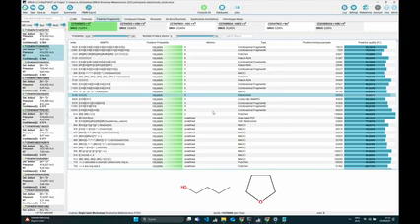In principle, it should work. I was wondering specifically because sometimes you might get compounds that are ionizable in both modes, and sometimes you don't, and then maybe it skews the ranking. You mean you include some bias? Yeah. I never looked at it, basically. It's a very special case, but in general I would expect it to work in this way. If not, we probably need to look into it in more detail.